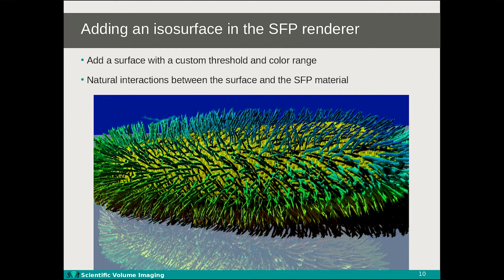A new feature in Huygens 19.10 is the ability to add an ISO surface to the SFP scene. The surface affects the SFP simulation and the SFP simulation affects the surface, leading to a natural-looking interaction. The surfaces cast a hard shadow on the table and the SFP material below it, while the SFP material partially obscures the surface and casts shadows on it. By using surfaces in the SFP scene, specific features of the objects can be accentuated.